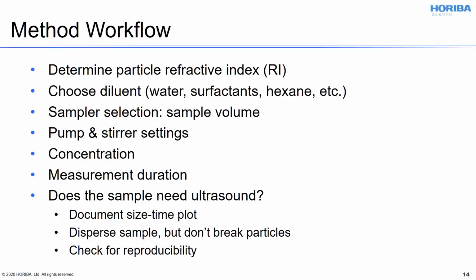You want to pump and stir enough to keep the particles in suspension, so that they don't all settle to the bottom or float to the top. Although I think about it, for a ceramic group, there's not very much floating happening. You'll want to determine particle concentration. That's a pretty systematic study, and that's not intellectually challenging, but you just have to sit down and do it.